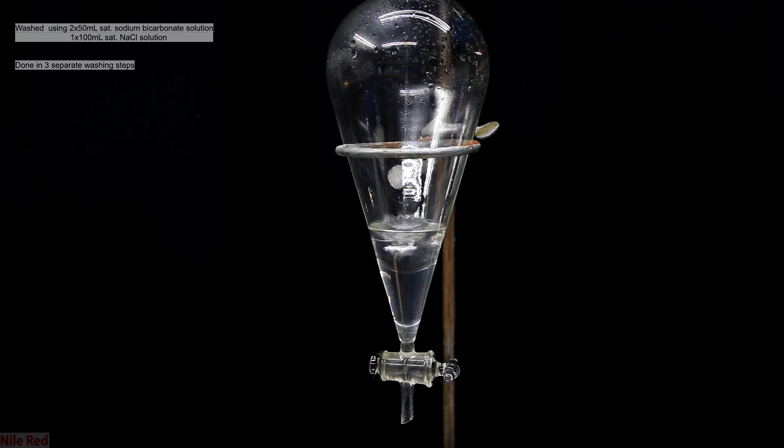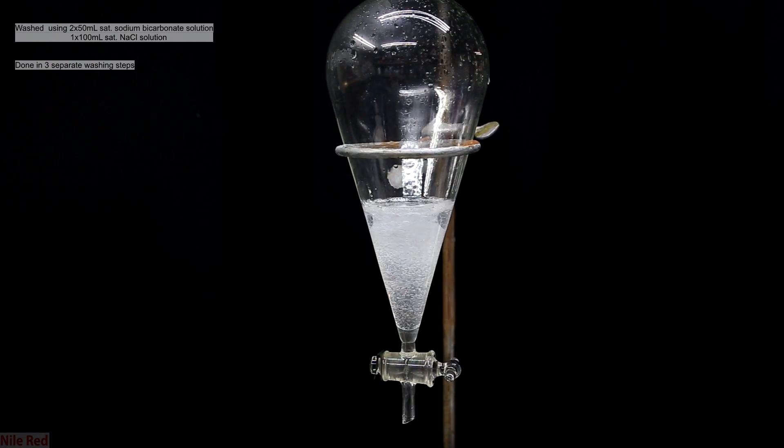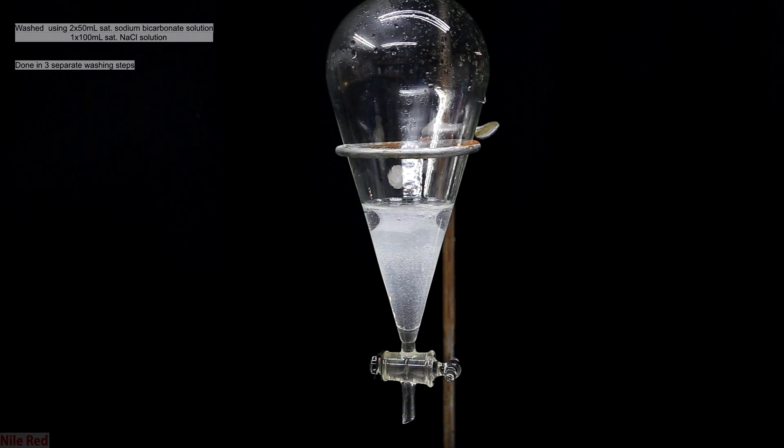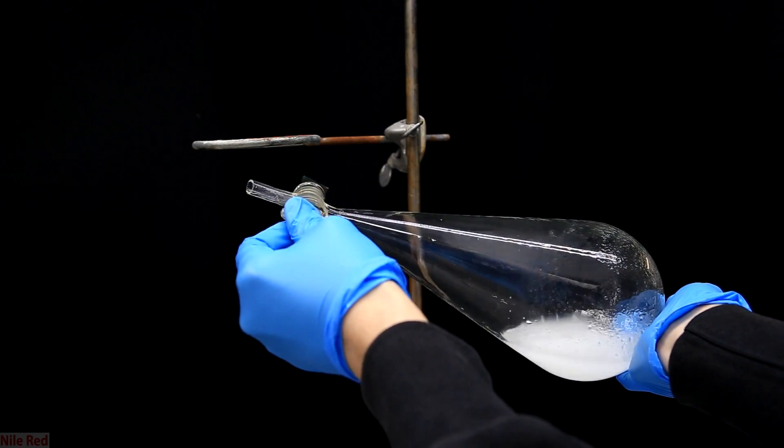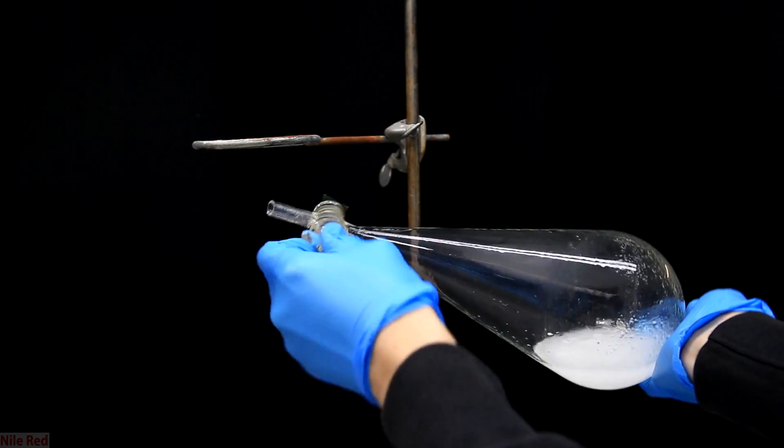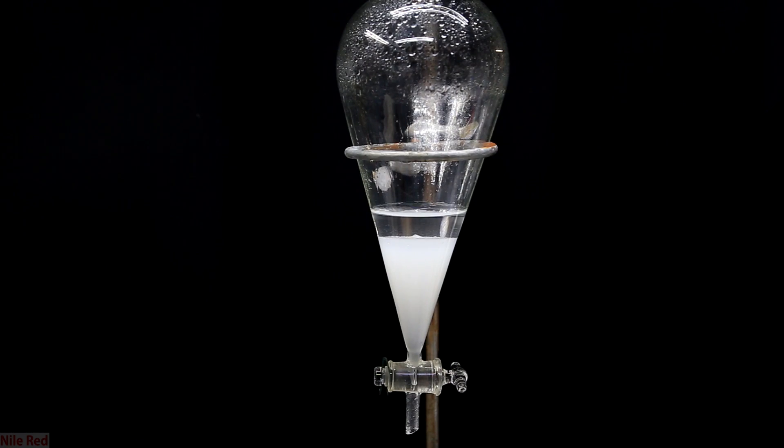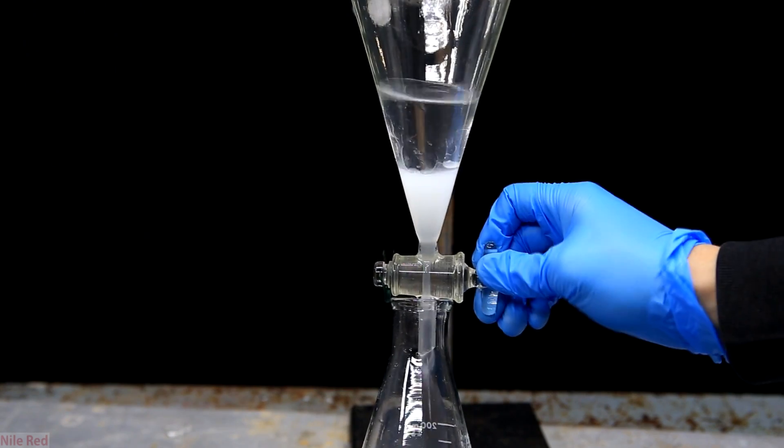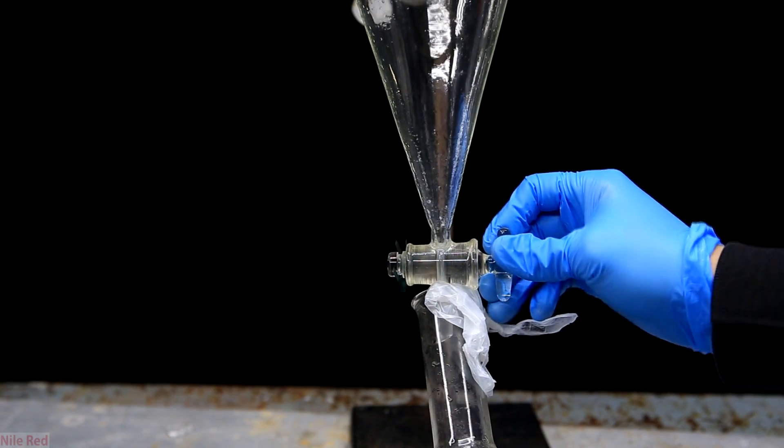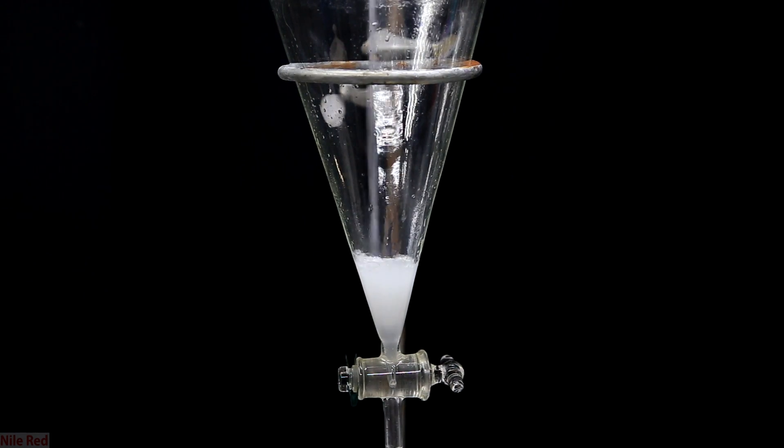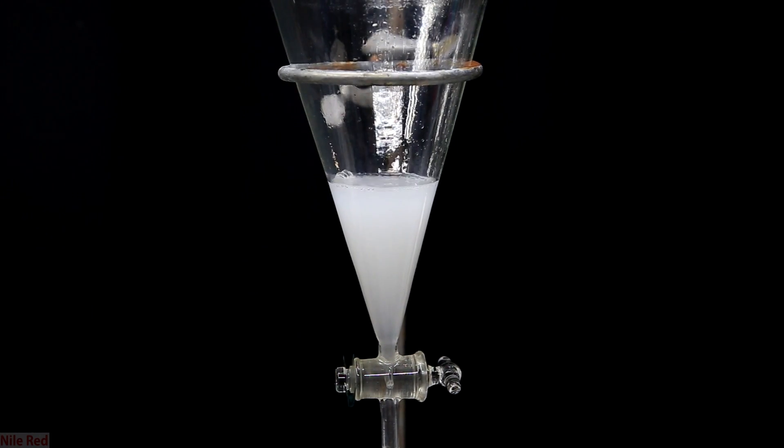We now have to clean up the benzyl chloride and to do this we start by adding 50 milliliters of saturated sodium bicarbonate solution. This will react and remove any hydrochloric acid that remains dissolved in the benzyl chloride. After the bicarbonate solution is added we cap, shake it and vent frequently. When neutralizing acid with sodium bicarbonate we produce a lot of CO2 gas so it's very important to vent frequently. Then just like before we put it back on the stand and we let the layers separate. Our bottom layer this time is actually the benzyl chloride and we drain this off. The upper layer is our sodium bicarbonate solution and we drain this off and discard it. The benzyl chloride is then poured back into the separatory funnel and we wash it again with 50 milliliters of sodium bicarbonate solution.